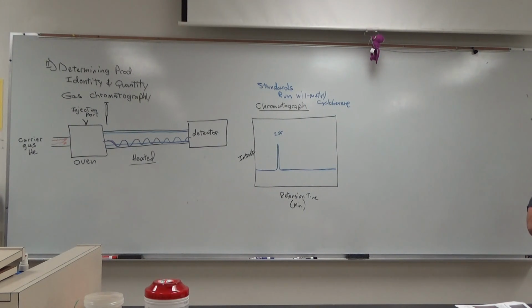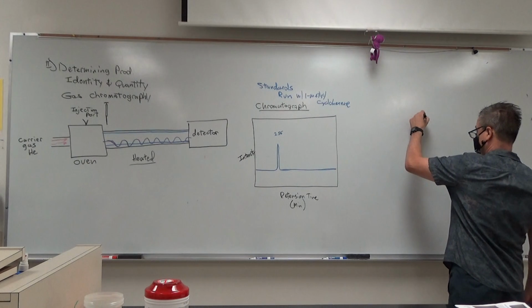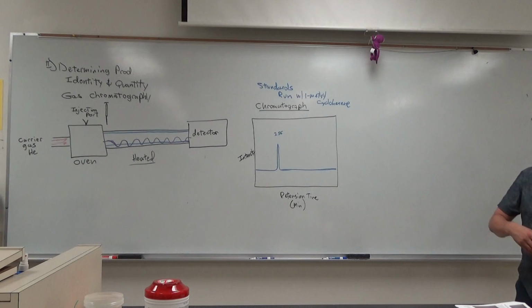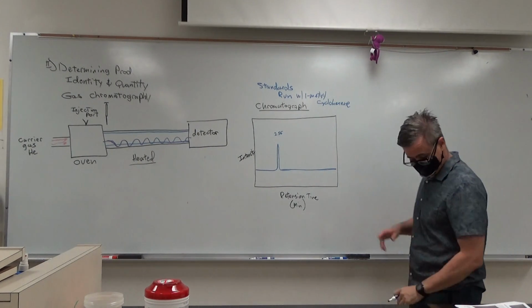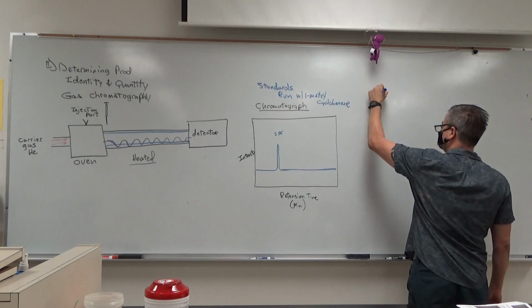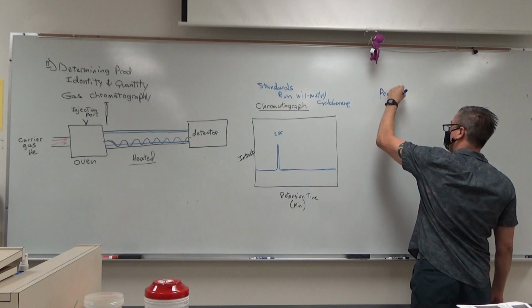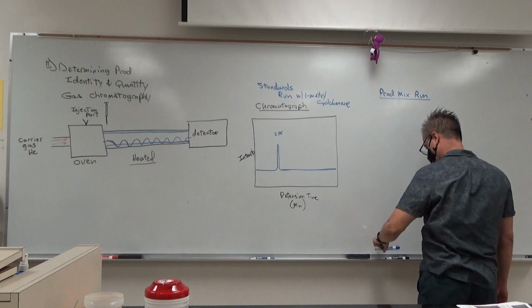The machine has been used a lot, you know, it has changed, etc. So they will probably run their standards today, and those will be good for all the runs that we do for all the sections of this class all week. And then you do your product mixture run. Okay?